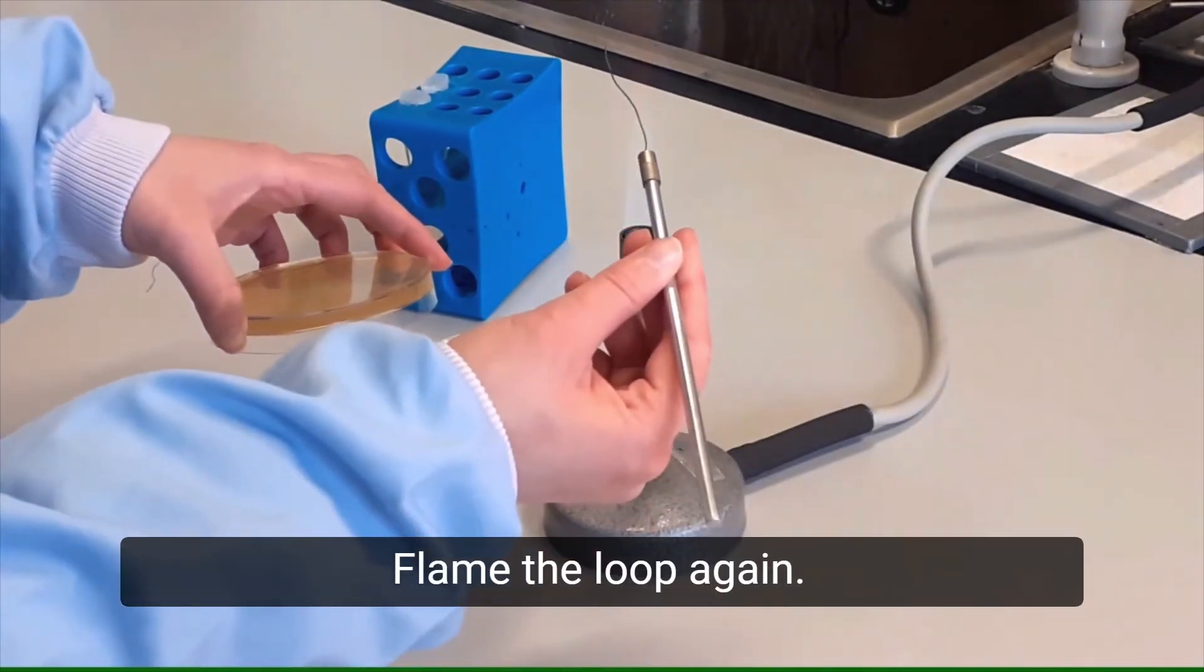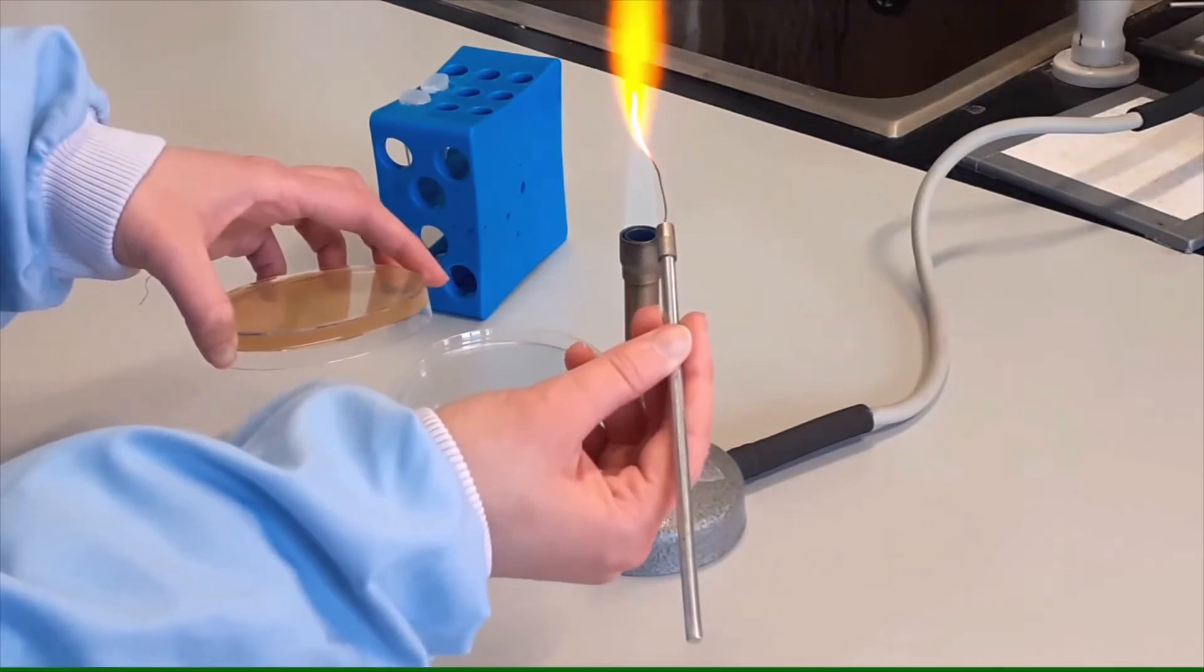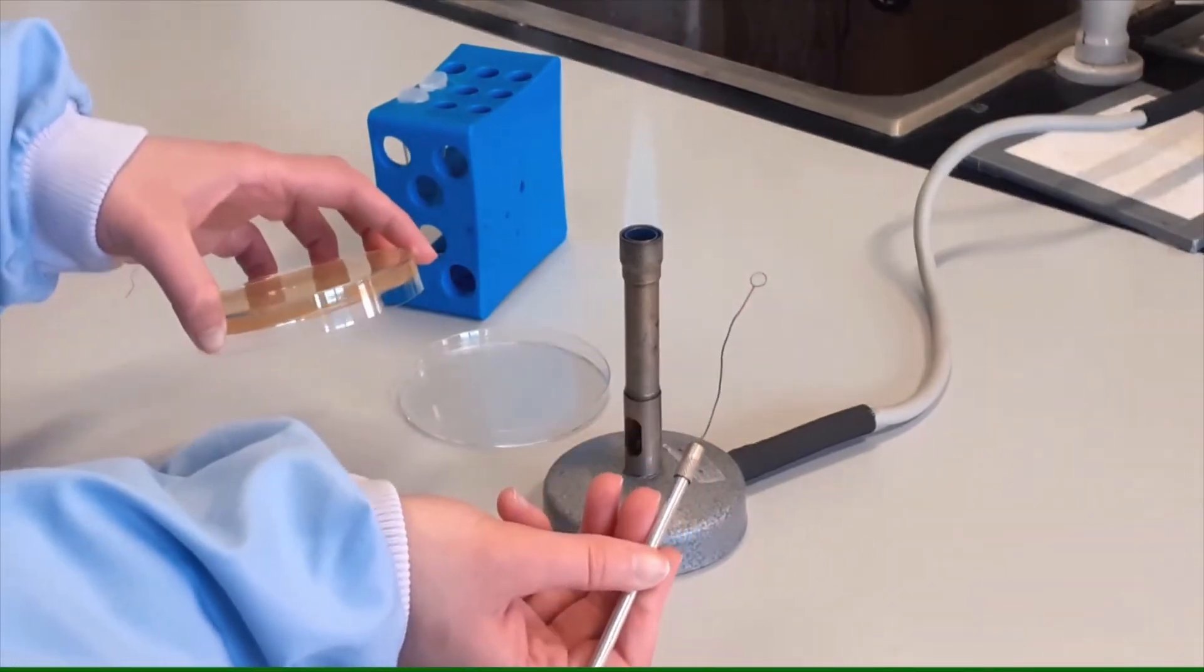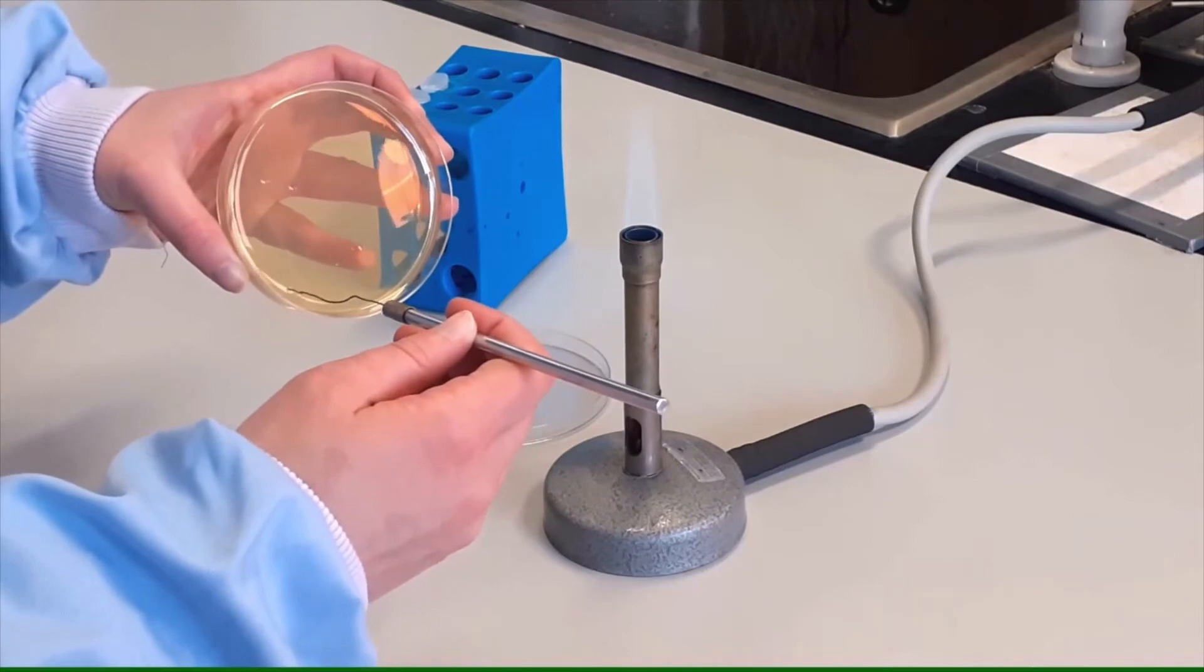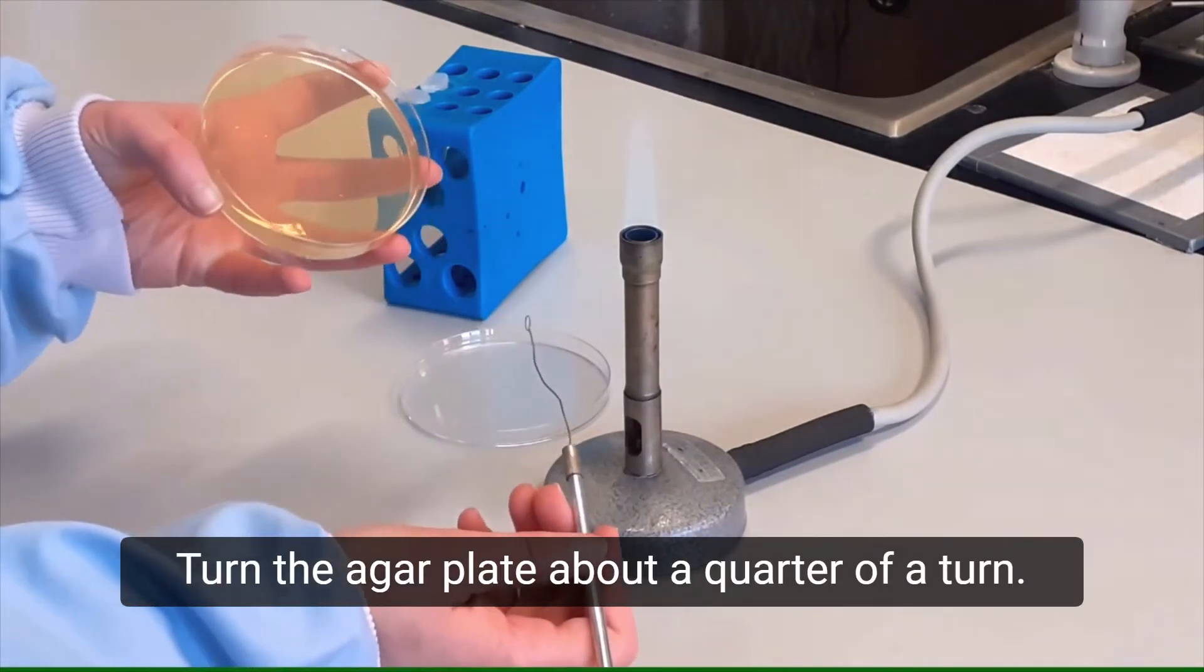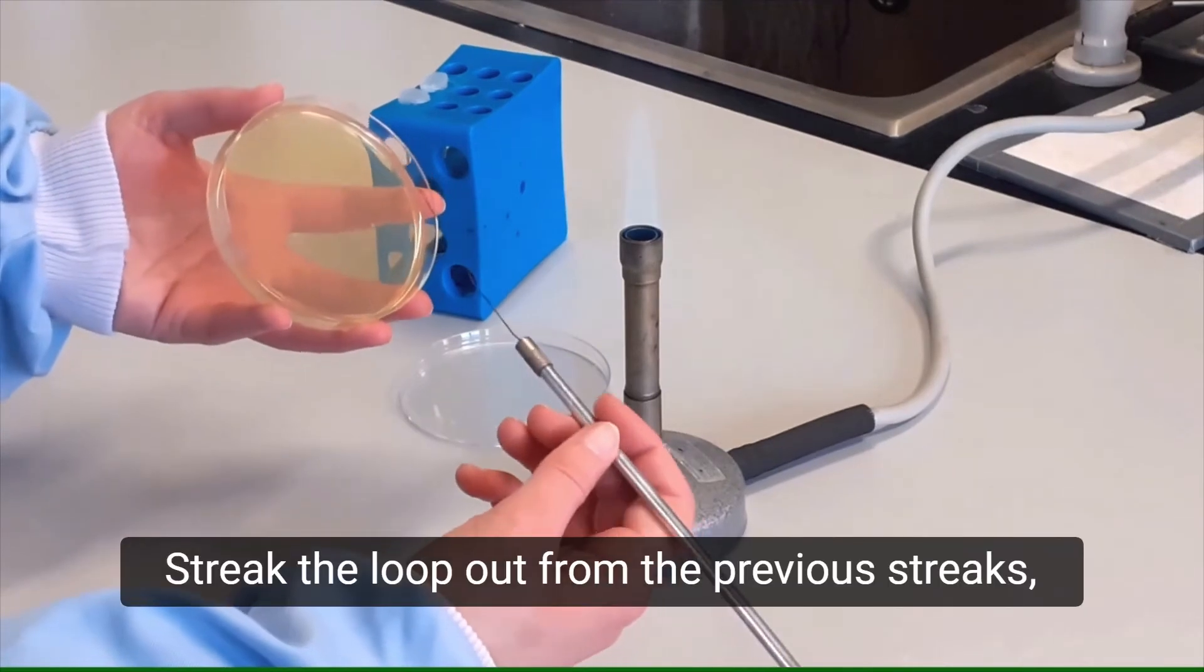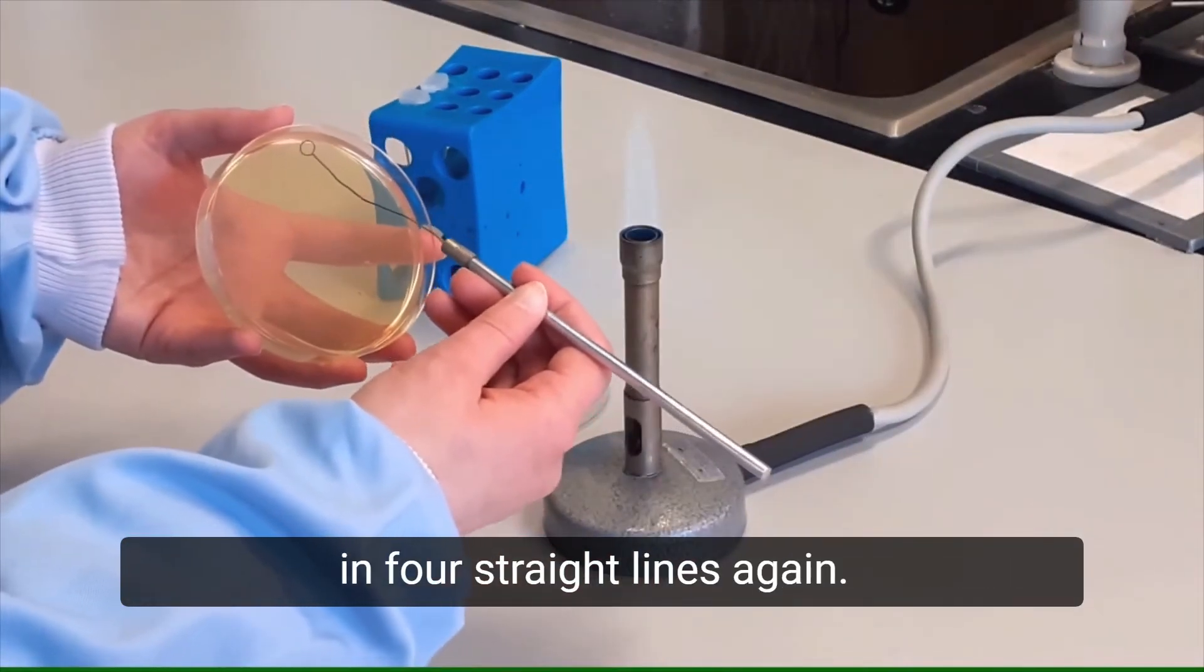Flame the loop again. Cool it in the agar as before. Turn the agar plate about a quarter of a turn. Again, streak the loop out from the previous streaks in four straight lines again.